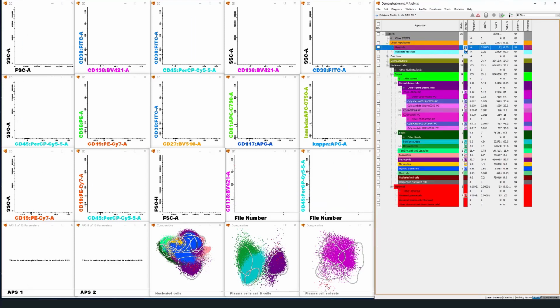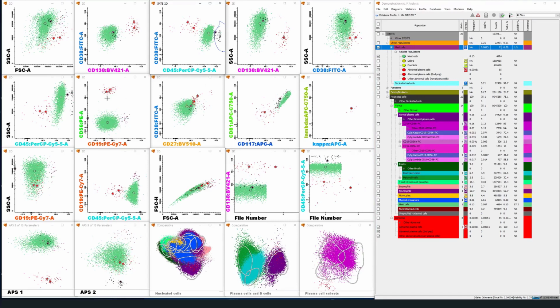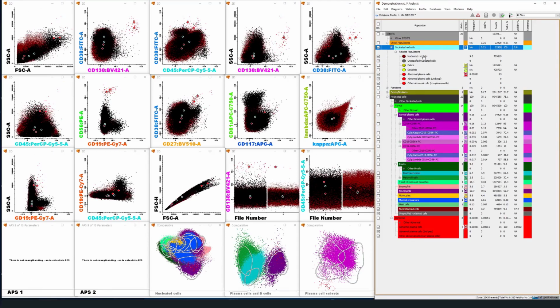And almost done. Mast cells are of course pretty important. As I mentioned, they are a marker for bone marrow quality, and these appear to be some debris, and the rest, they appear to be doublets, since in the singlet view they are larger and they form a sort of CD19 positive subpopulation, which is not seen in mast cells, of course.